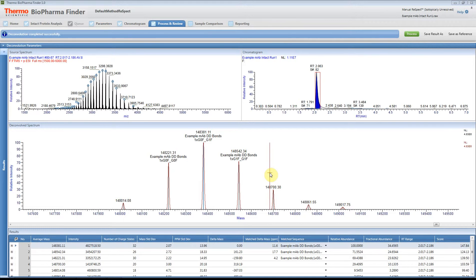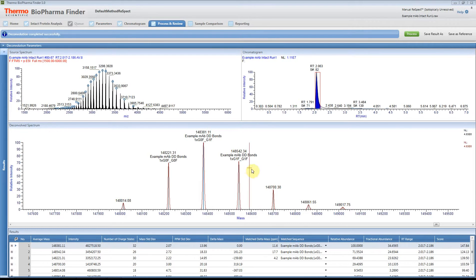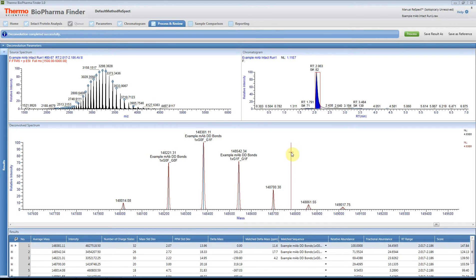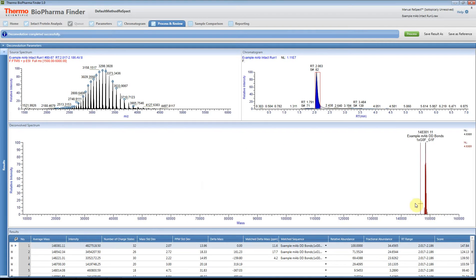Here you have an example of Biopharma Finder. You're looking at the Intact workflow. Let's say we'd like to copy the Deconvolved Spectrum from the software. What you want to do is, in this example, I've actually zoomed in.